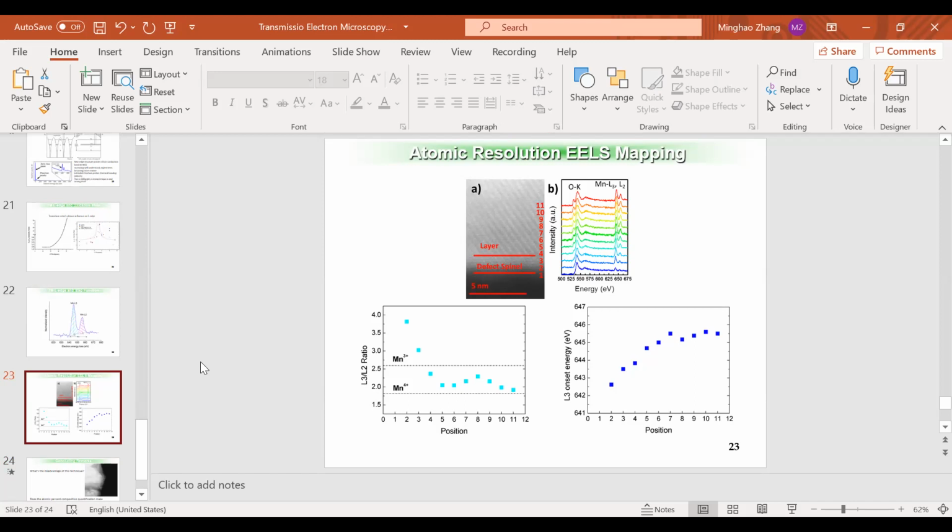Okay, that's interesting. How is the energy of the electrons actually affected by the biasing in that process? Because I would imagine you're introducing a lot of electrons through the actual cycling of a battery. Yeah. So first of all, personally, I don't have strong proof of how much the biasing will induce to the electron diffraction.